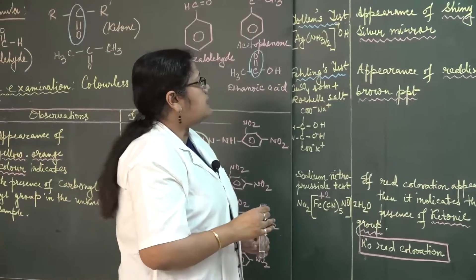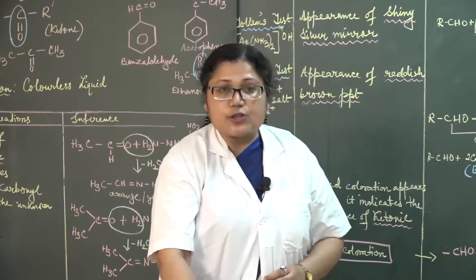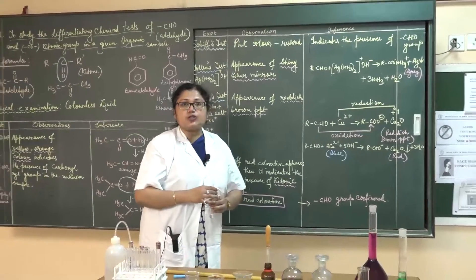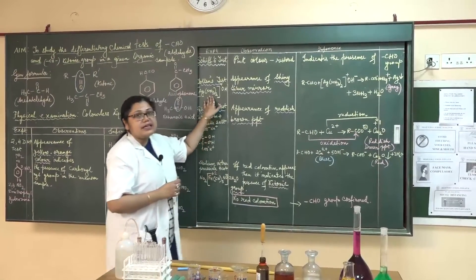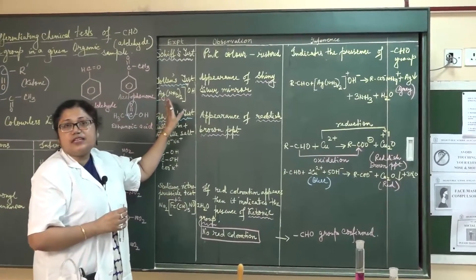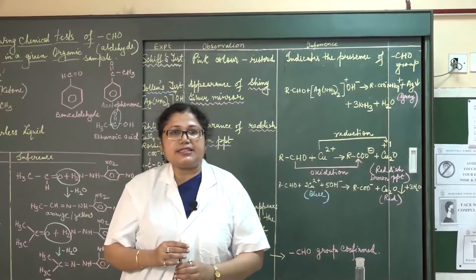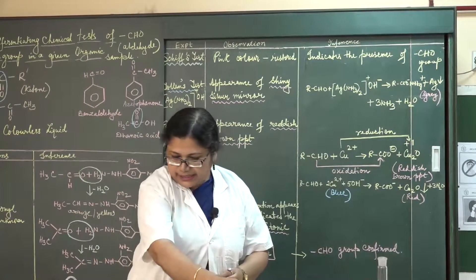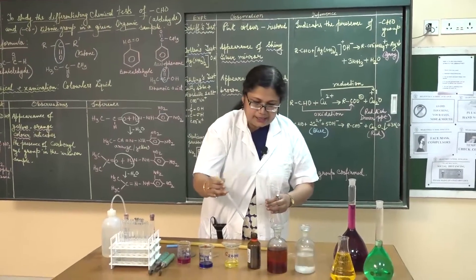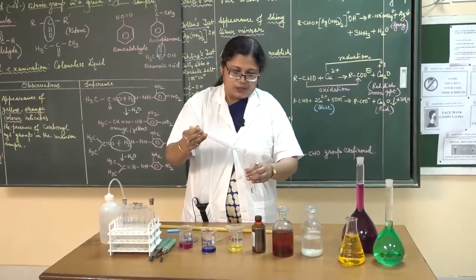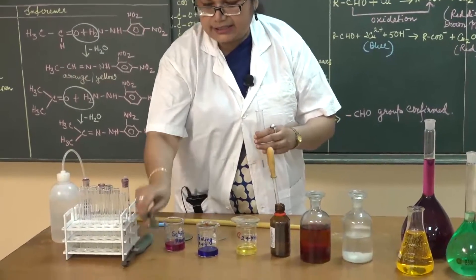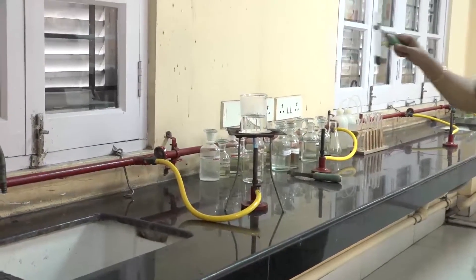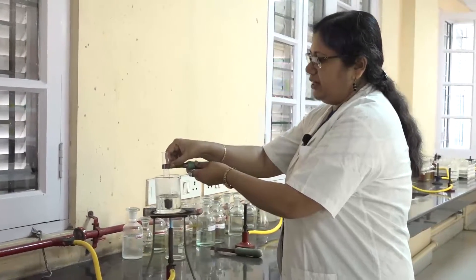Next we perform Tollen's test. Tollen's reagent is a solution of ammonium hydroxide and silver nitrate. On mixing the two solutions in equimolar proportion, we get a complex diamine silver(+), where the oxidation state of silver is +1. Tollen's reagent is a mild oxidizing agent — it oxidizes aldehyde into its corresponding carboxylic acid. I take a little quantity of the organic sample, add a few drops of Tollen's reagent, and then heat the reaction mixture in a water bath for 5 to 10 minutes to see the change.